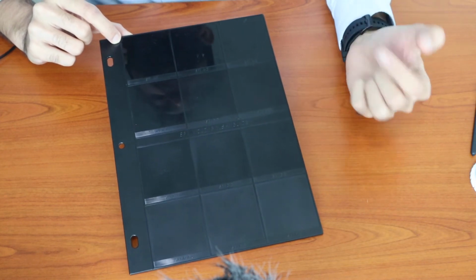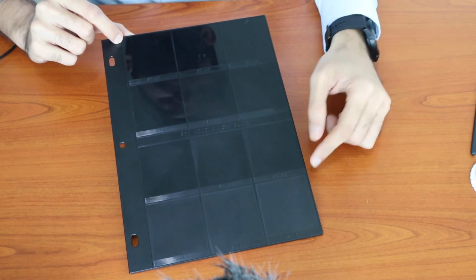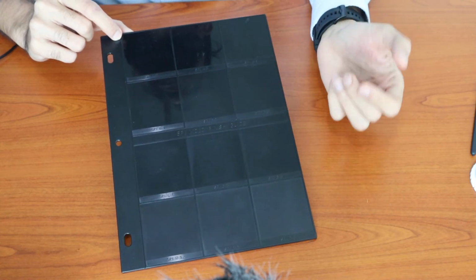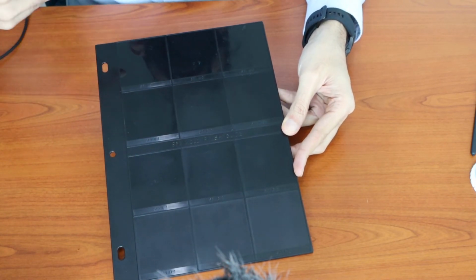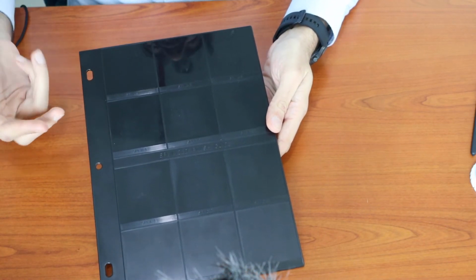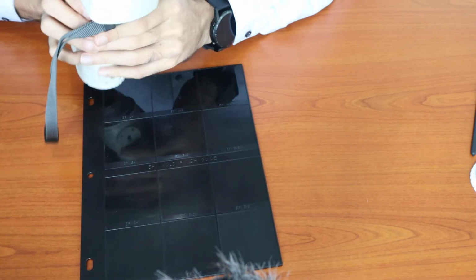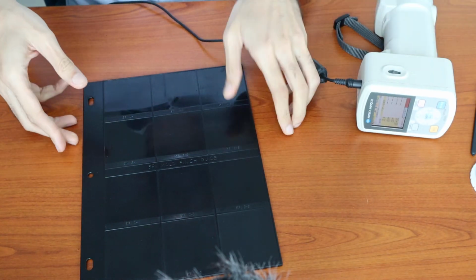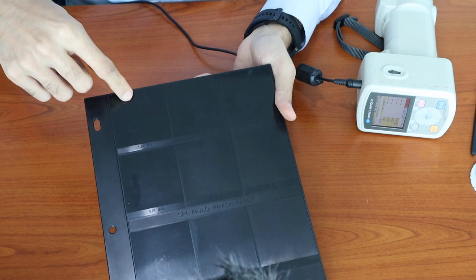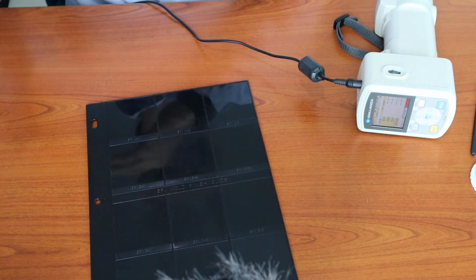whereas the SCE mode works exactly as it would be in visual, meaning that if there was a color change or appearance change due to the glossiness or the appearance, then the SCE mode will detect it. To illustrate this, I will take a target measurement on the matte gloss, and I will take a sample measurement on the high gloss, and we will view the color difference in SCI mode and also SCE mode.